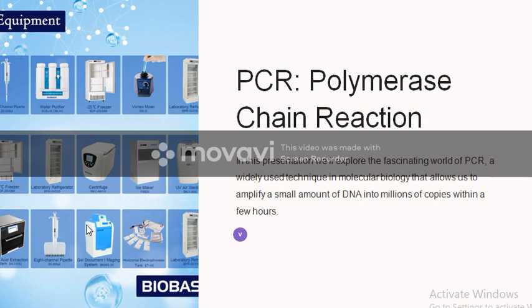In a crime scene, let's say you get strands of hair. You want to get that strand of hair, extract DNA from it, and then multiply the copies. Once you multiply the copies, you have enough DNA sample which you could use for multiple purposes, such as comparing it with the suspect's DNA samples. So this is where polymerase chain reaction comes in handy.